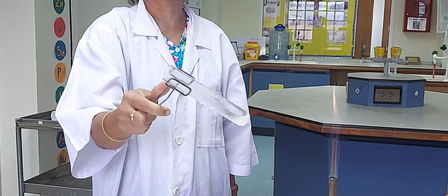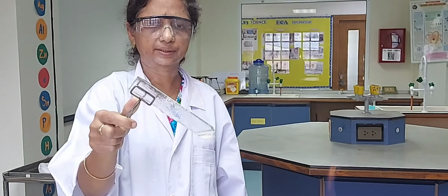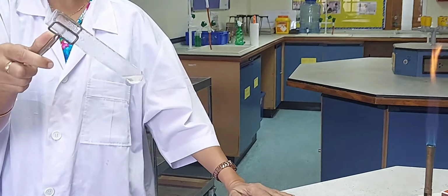Now, calcium hydroxide is not completely reacting. There is the settling down of the unreacted solid, which may be excess of calcium hydroxide, which has not reacted.